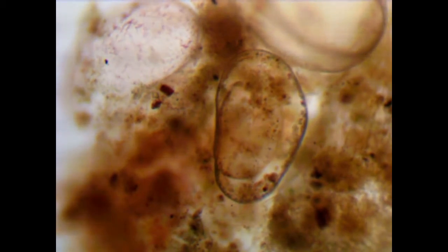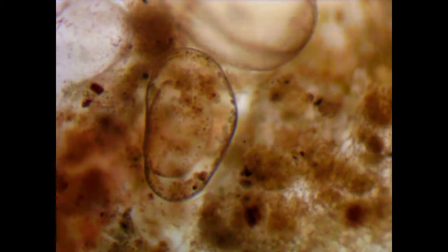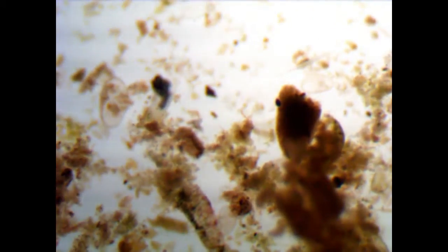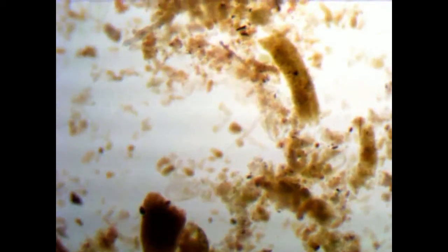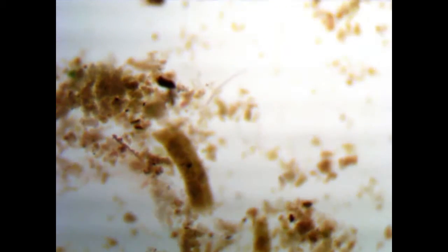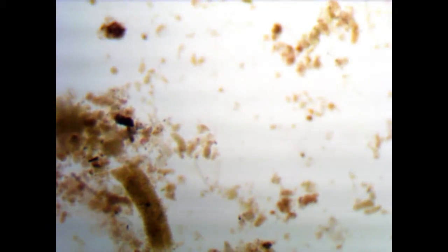Once again, this is sample A, and we'll be transitioning over to the next sample. I didn't find a whole lot that was interesting in this sample, except for that little creature right there, which I believe is a rotifer. So this is still sample A, but we've transitioned over to, oh, what's that? I believe that is perhaps a nematode, actually. Some sort of aquatic nematode. It could be a very, very first stage of the mystery organism that you will see soon.